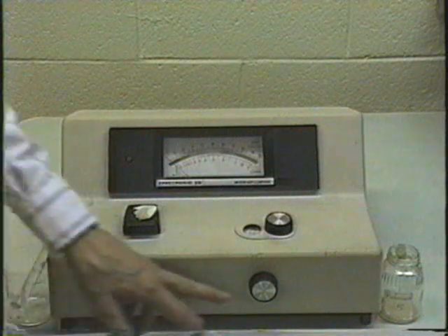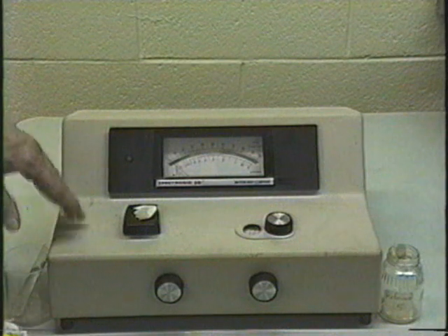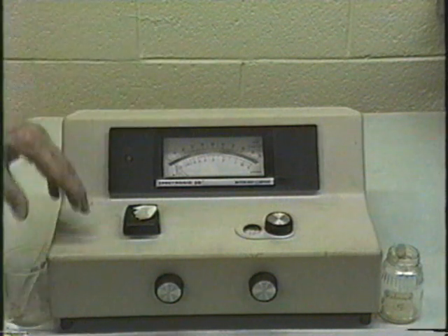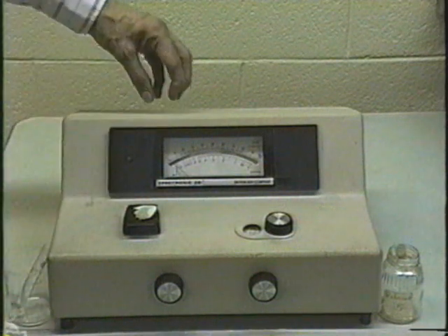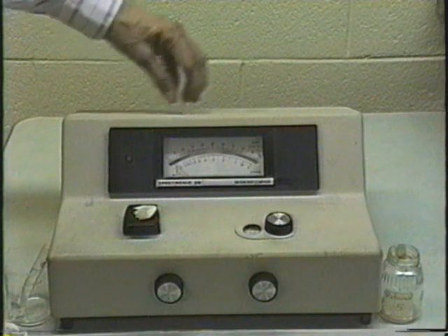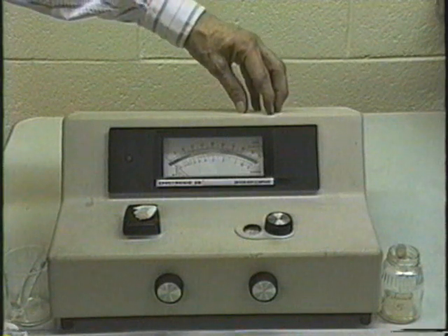Now there are two other controls on the spectrometer here. What you want to make sure is that when no light is passing through the sample compartment, the meter reads 0%. And when the light is passing through distilled water, it reads 100%.